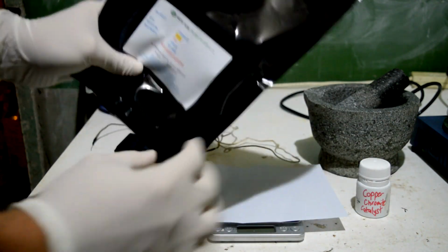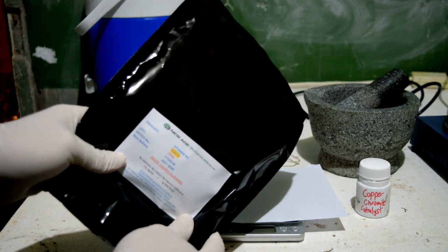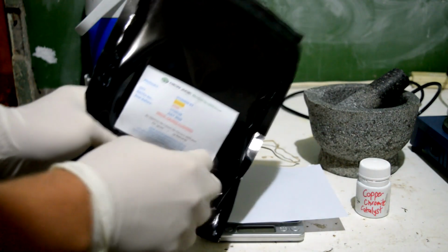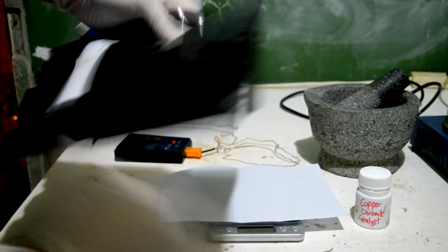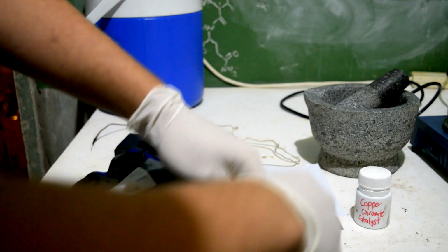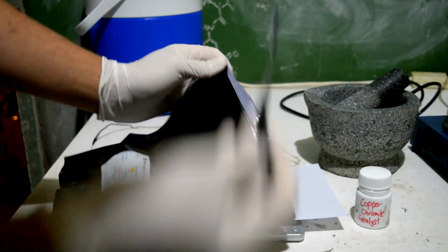And also, from the look of those pictures in the 500ml flask, it looks like we could possibly sneak another 10 grams of niacin in there. So we'll put 70 grams of niacin with 2 grams of catalyst. So I'll just weigh that out now. I get the pleasure of opening a brand new packet of chemicals. Oh yeah, beautiful.